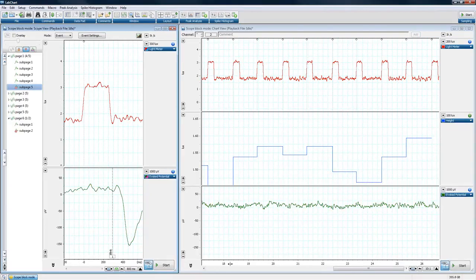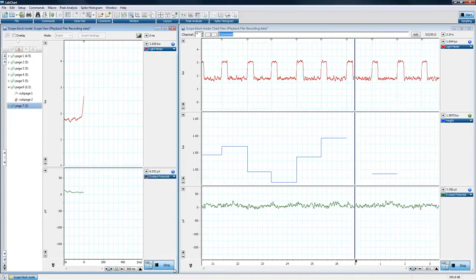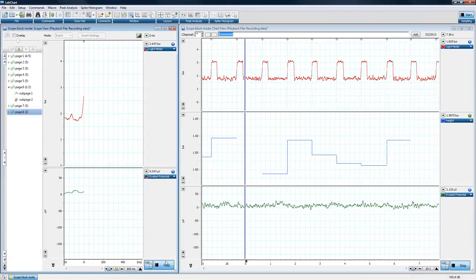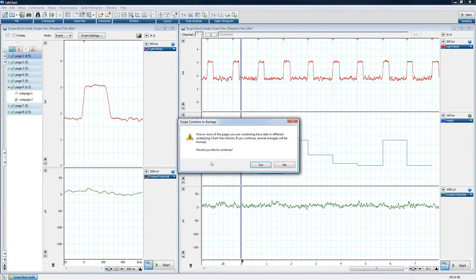As we click Start here again and continue to get our continuous data, if I hit stop here, you can see we have our different events that are found and automatically averaged, and we have all that information, which is great. Now that we have our different groups, we have groups of 5. Some of these are excluded. I can actually still average these groups and average those further.